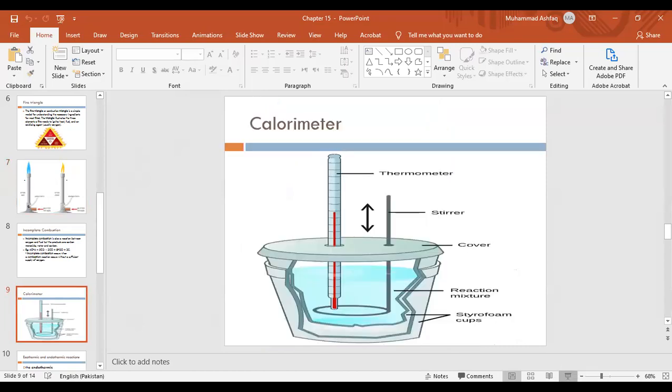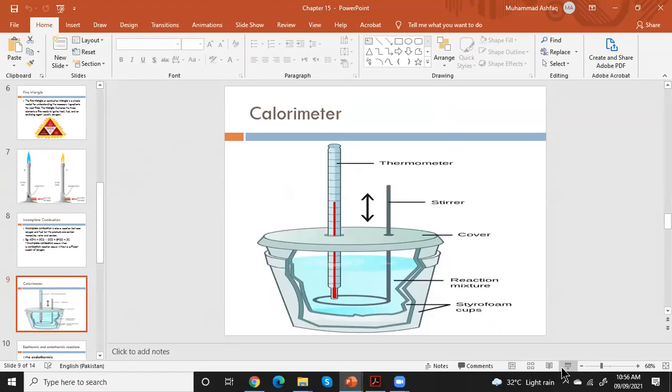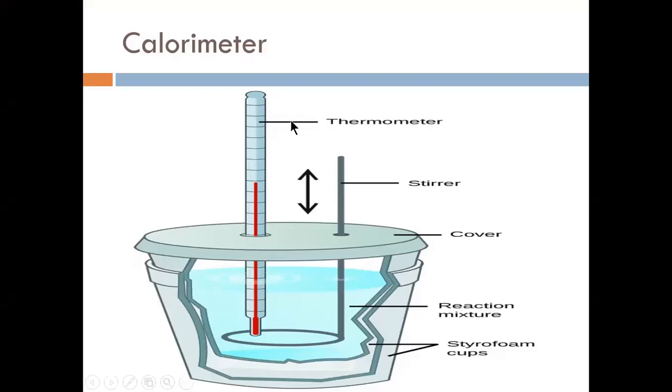Now I just make it a little bit slide share, so it will be easier to understand. Here is the thermometer that you dipped in the water. It's the stirrer, you use it to move the water. Here is the reaction mixture, and that is your styrofoam cups.